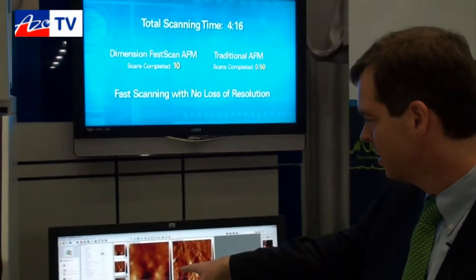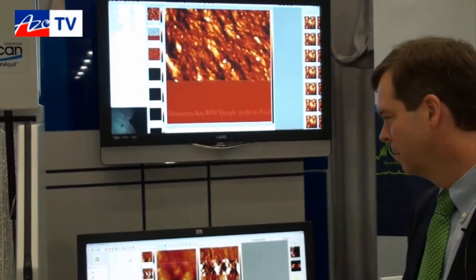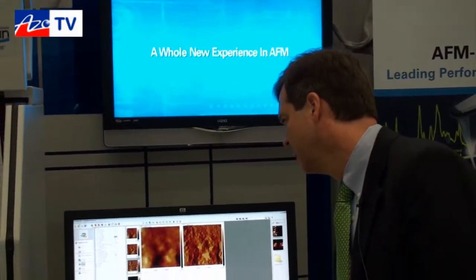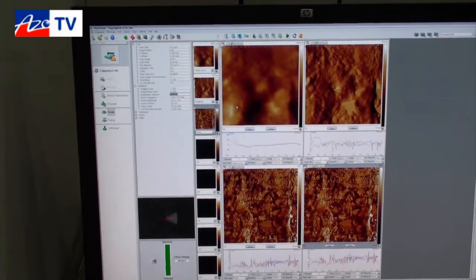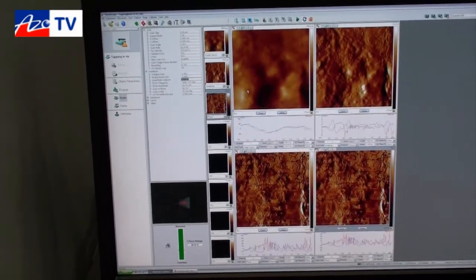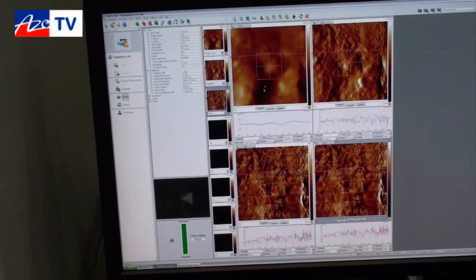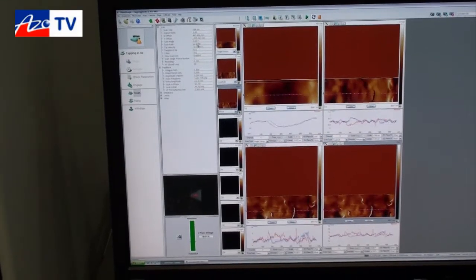You can go up to 100 times faster. For instance, I'm scanning right now at 20 hertz. I can come in here and crank it up. By doing that, I may lose a little resolution, but you can see I'm going to be collecting an image every 9 seconds. So if you needed to go that fast, that's not a problem. This is at 62 hertz and it'll start to lose a little bit. I'm just adjusting my amplitude down a nanometer. I'm still scanning very fast — we're not going to claim the resolution will be the same, but it still looks very similar to what I was getting originally. It's designed to go at a very fast rate, and it'll be fine for samples that don't have such fine detail. A lot of times it can still have quite a bit of detail. I can zoom in to a slightly smaller area, and since this is a closed loop system, that can allow you to go even faster.